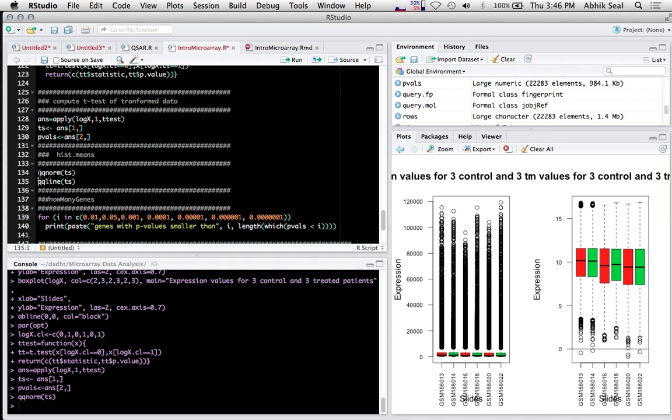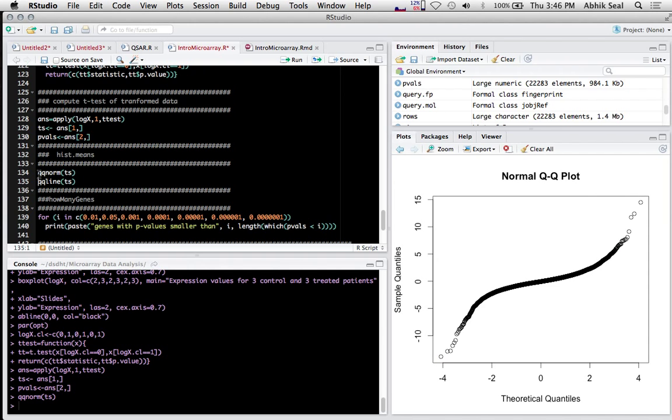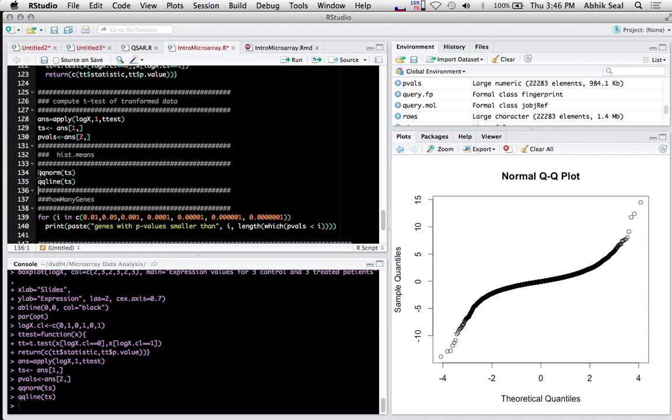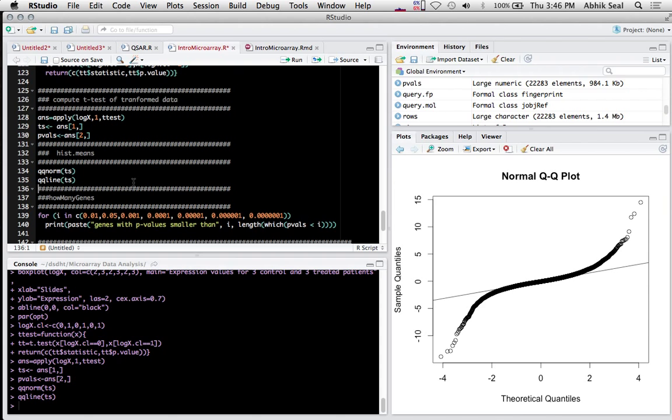Now you can plot the Q-Q plot to see how much it is normalized. This section is not normalized.